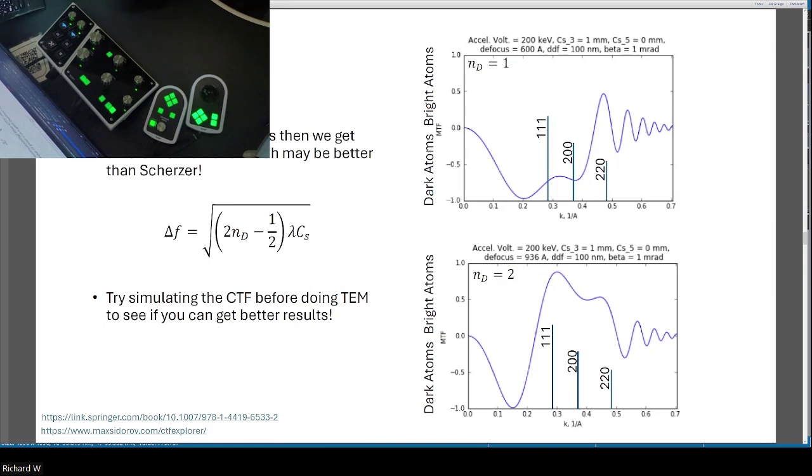If you were to do this thoroughly, then I was relying on the value the microscope outputs. It shows me that it's 93 nanometers out of focus, and I'm trusting that. If you wanted to do this properly, you should probably calibrate that value, or at least calibrate the step of your focus knob. So how much does each click change the focus by?